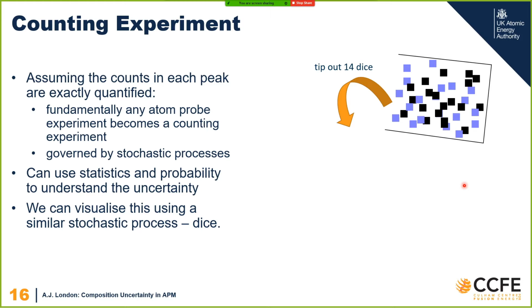So let's just do a quick counting experiment. And I've got a demo in the live script, which we're going to get to, to demonstrate this actually working. So you can play with it yourself.